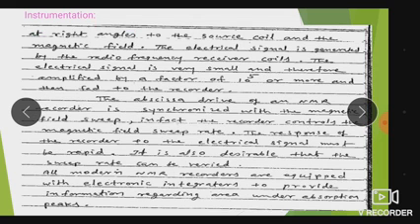Then the abscissa of an NMR recorder is synchronized with the magnetic field sweep. The recorder controls the magnetic field sweep rate.